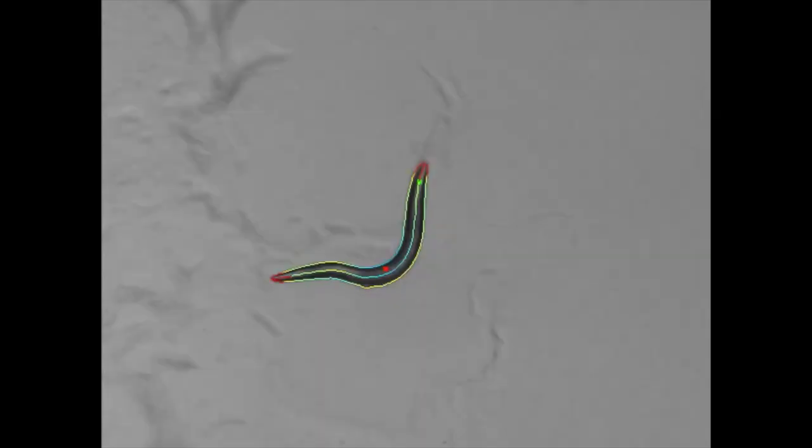Here is another video with an unusual scenario. Some users on the discussion board on Wormwatch have commented on this video saying this particular worm has a tentacle. In fact this is just a young worm that's hatched from an egg laid previously.